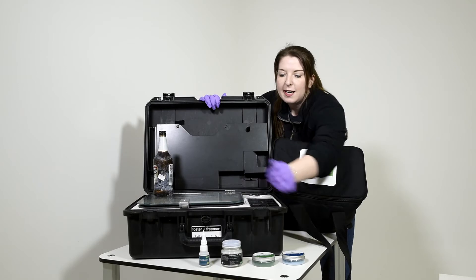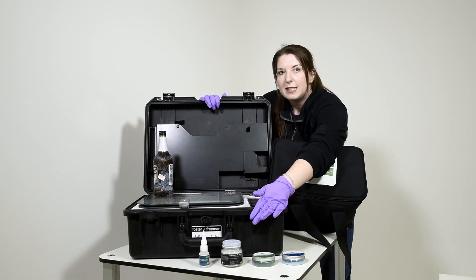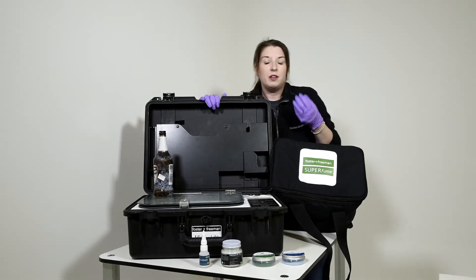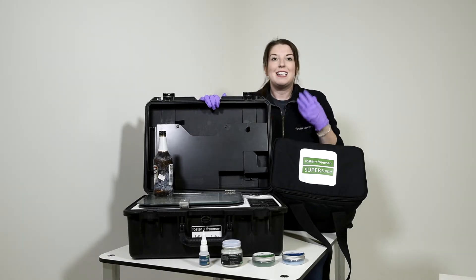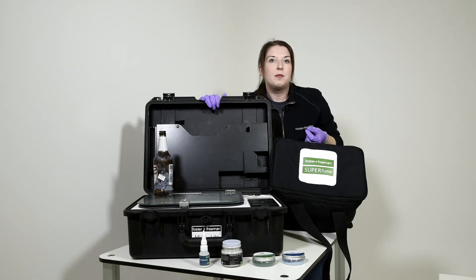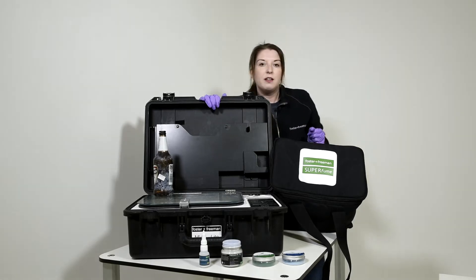We can provide Cyano Bloom, but we also have Polycyano as well. Polycyano is a cyanoacrylate glue which also has a dye stain embedded within it, which will emit fluorescence that we can view using light sources.